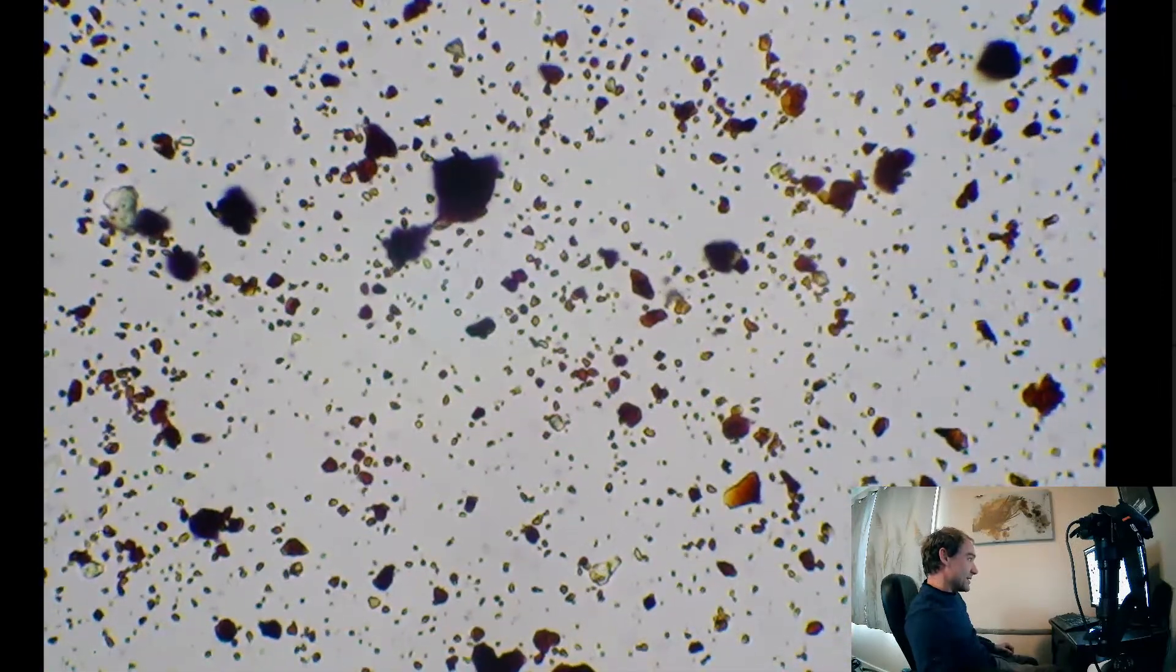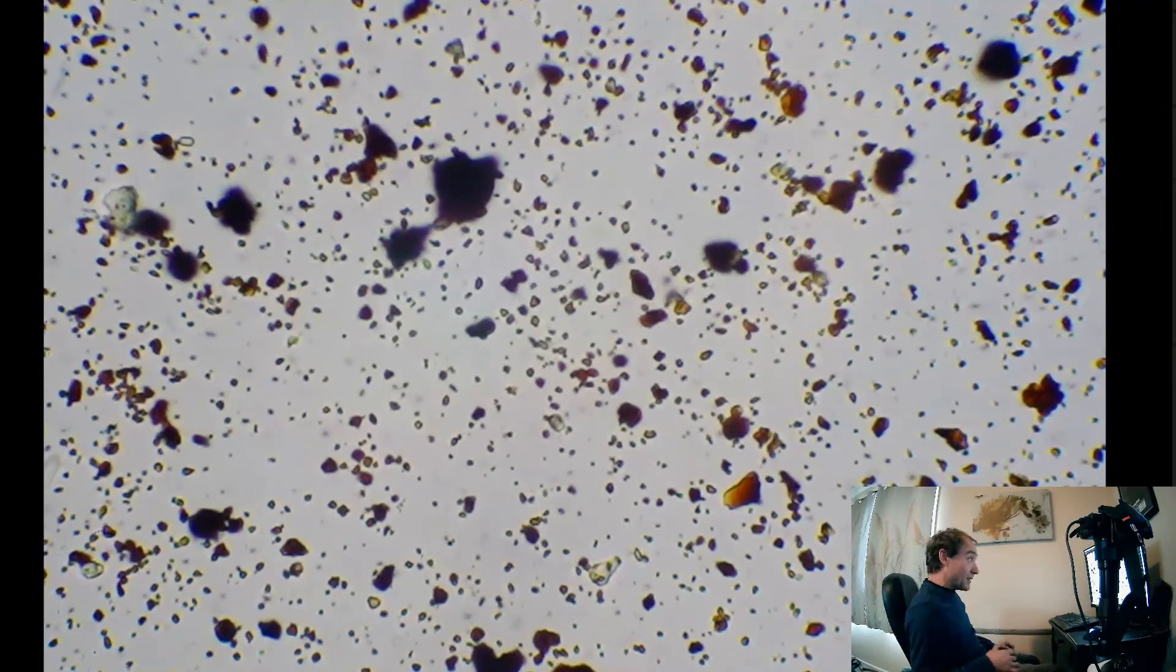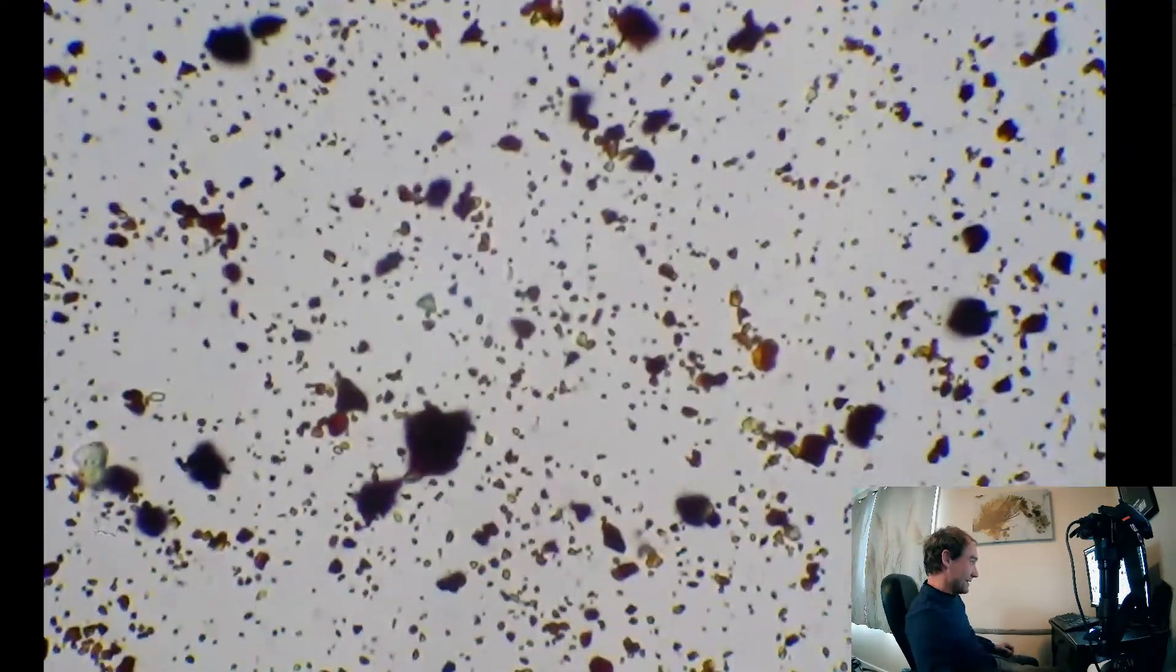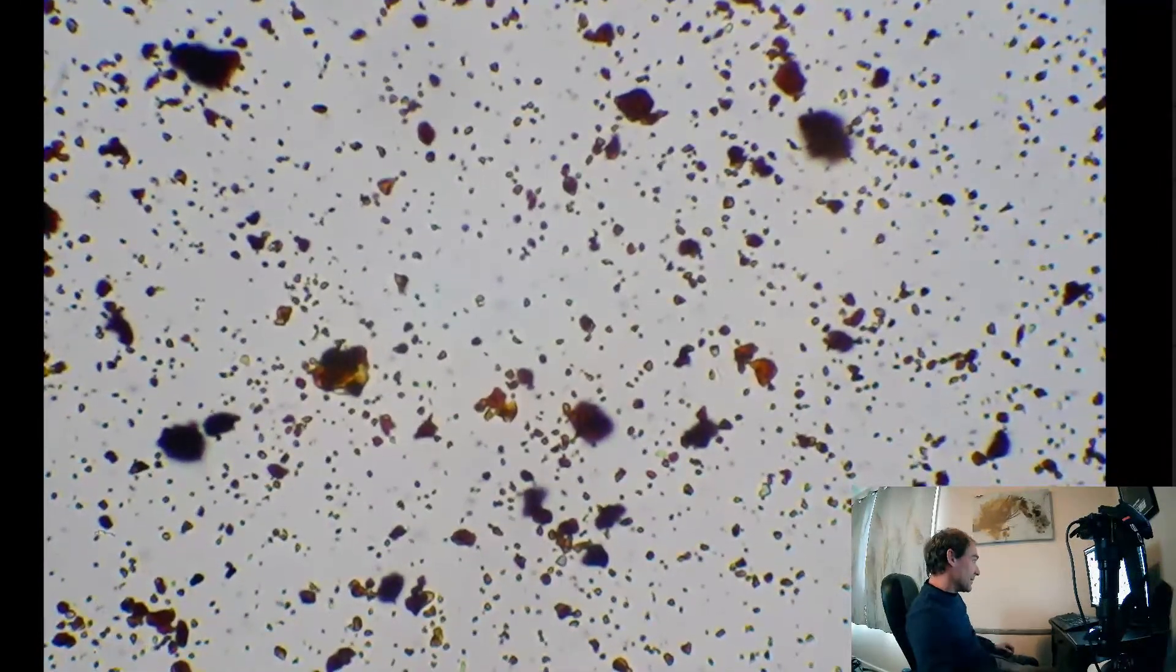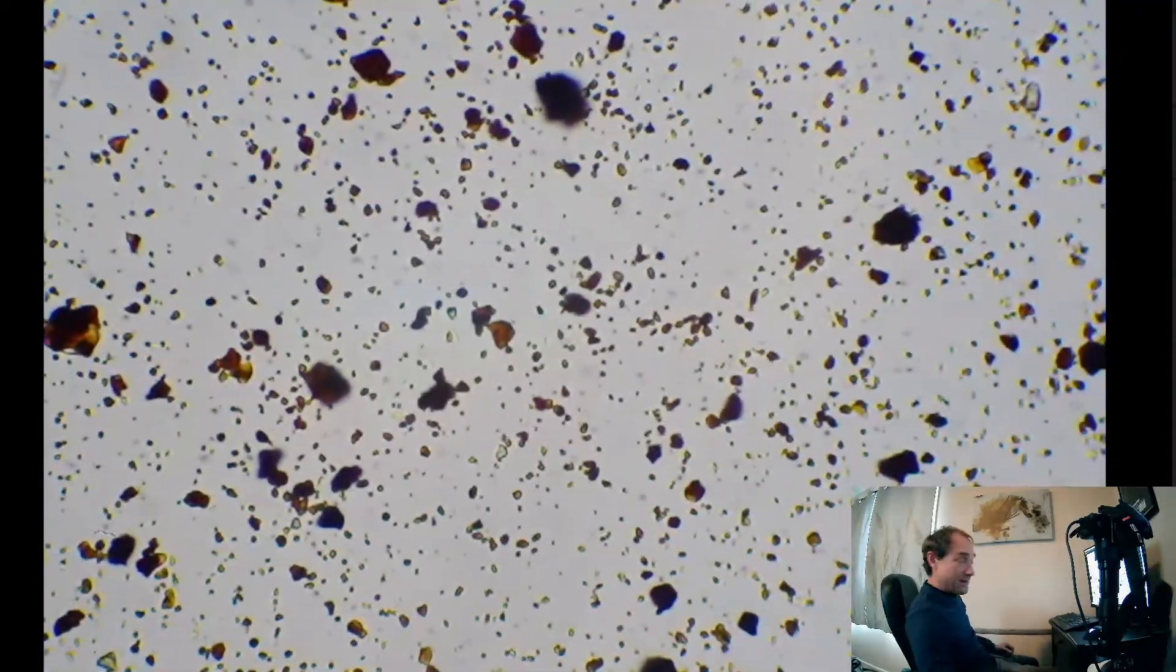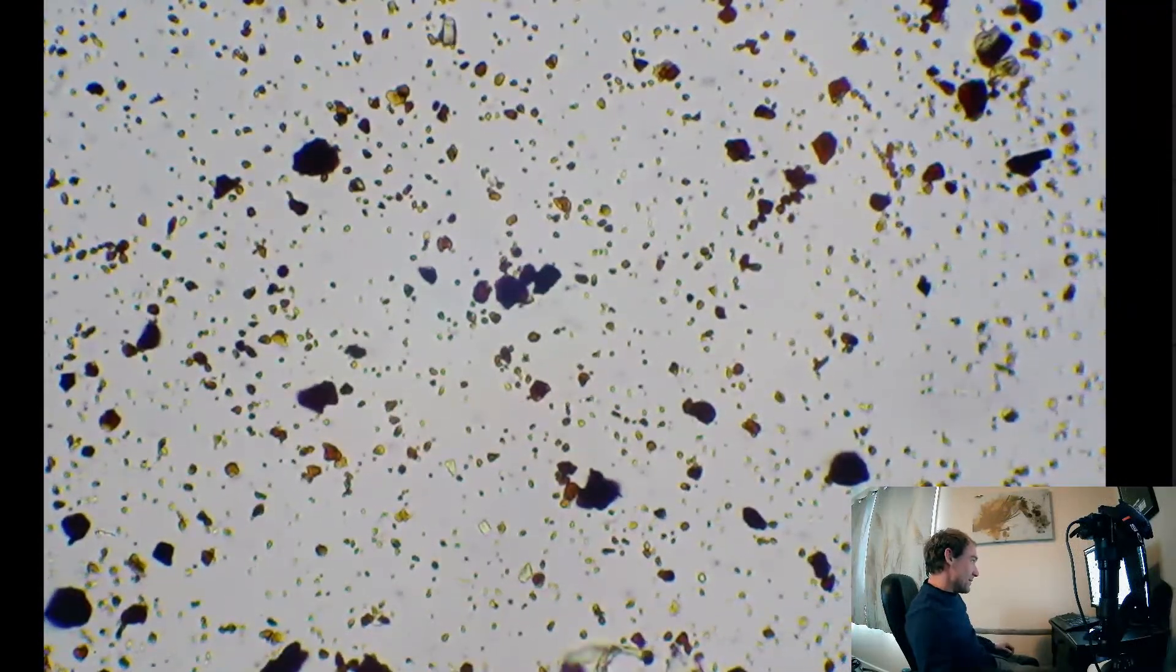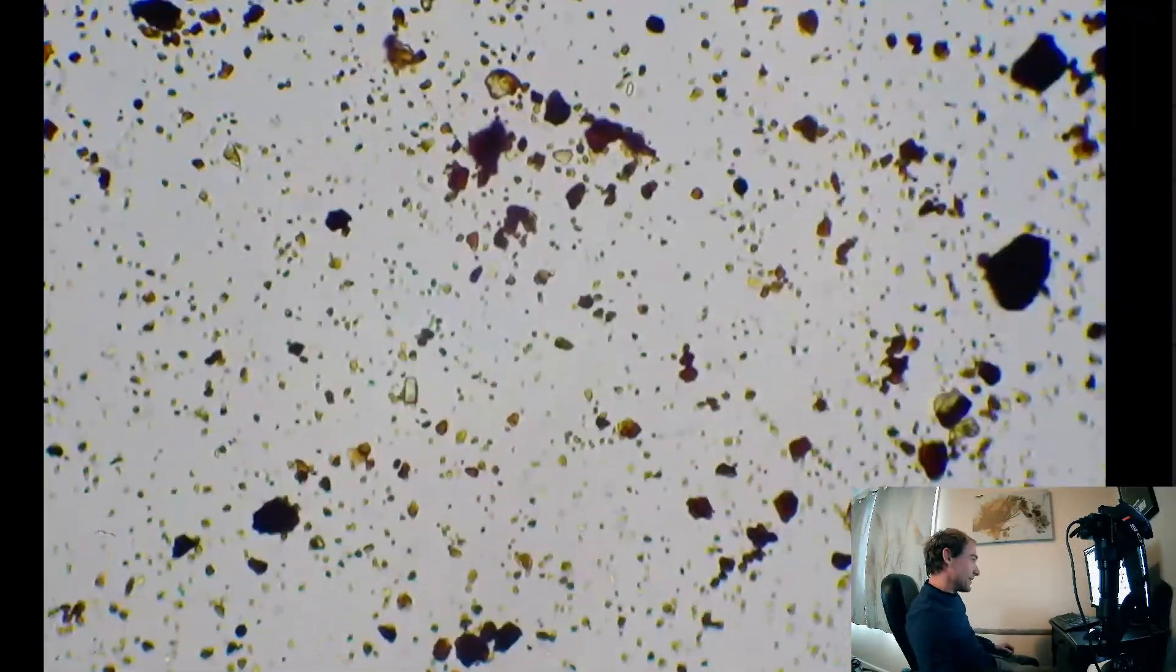This is especially for doing the dilution that I had to do to actually even be able to see through it. It's like thick like molasses, so I had to dilute it quite a bit so we can even make out stuff in there. Quite interesting.